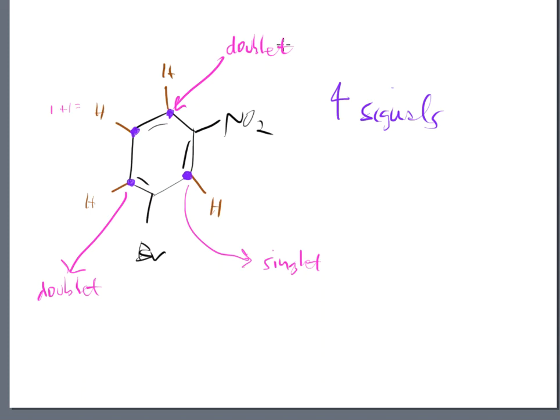So now we've got that 1 carbon that's left, and this 1 carbon that we're focused on is right here. Down below, we see a carbon with a hydrogen, and up above, we see a carbon with a hydrogen. So it looks like they both are CHs, but we've already identified that they are different chemical signals. They are not equivalent to each other.